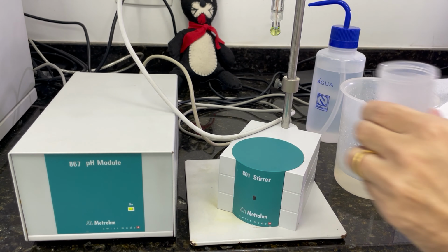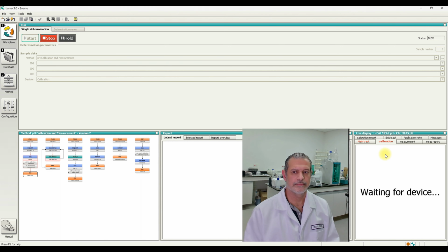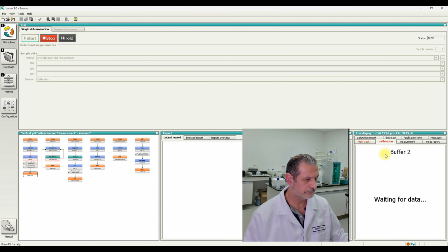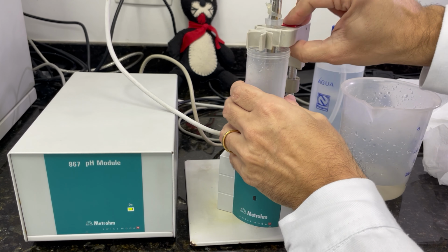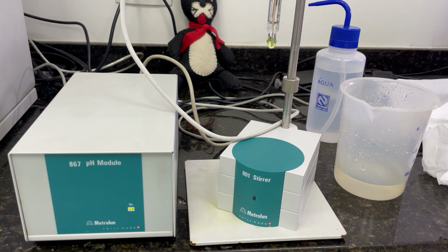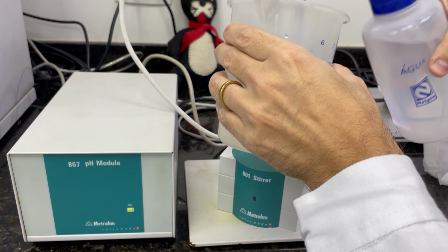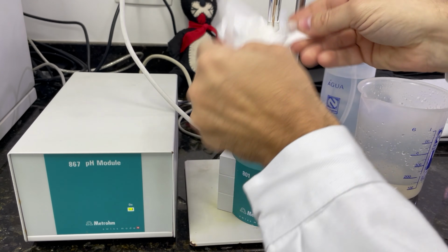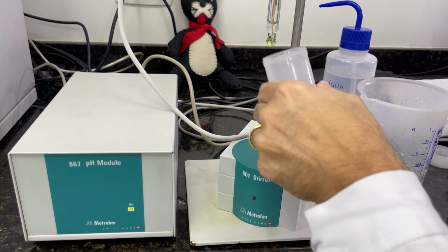Now the 7 on. Okay, 7. It's okay. Now the pH 9.